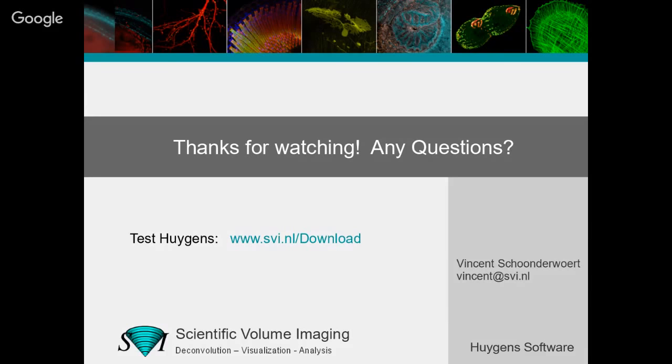And then a second question to that is, what if I then still cannot get good results? Well, then we advise you to very thoroughly inspect the image. In fact, you should do that every time and look for additional artifacts. We've seen many times in images that improvements cannot be obtained correctly because there is, for example, stage drift in the sample. If you're still doubting the results, just contact us, ask us questions, send us the dataset, and we will be happy to have a look at it.